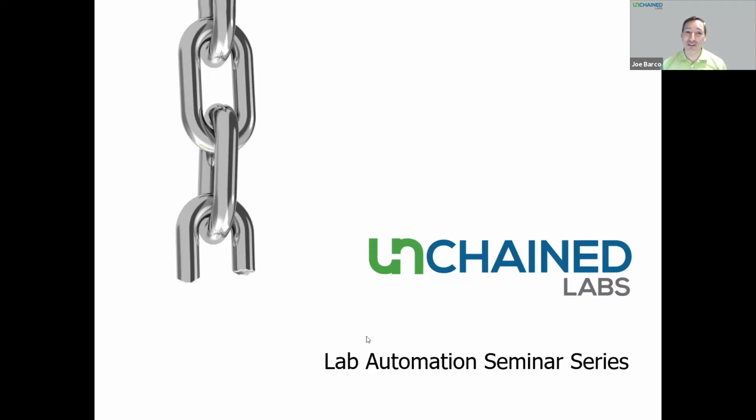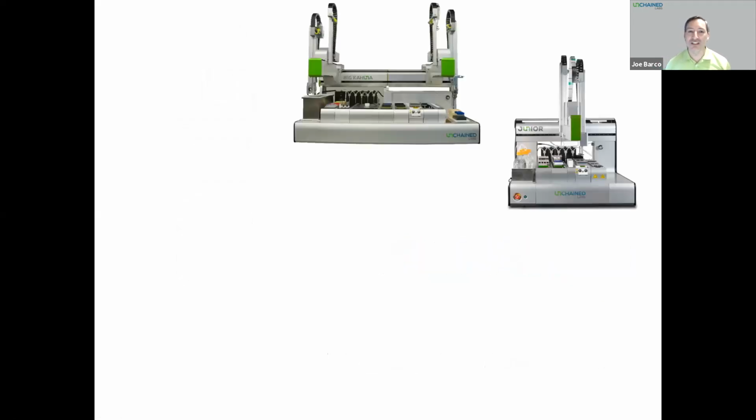Today's presentation will focus on software and data integration. When most of us think about lab automation, we think about liquid handling, powder handling, maybe some of the reaction setup. This could be a fully automated system like the Big Kahuna, or smaller distributed operations on a series of Juniors. Increasing throughput for experimental setup increases the need for data throughput as well.